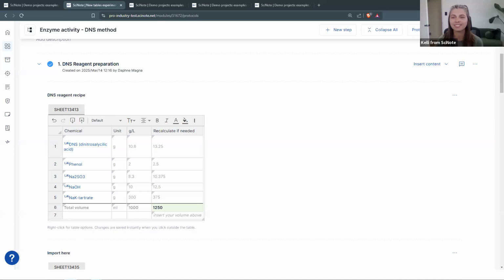both work. All right. Okay, so someone asked, I'm going to read the whole thing so we make sure you don't miss anything: I would like to ask if this update applies also to the already existing tables, which we already have in the protocols. Because in our team, we are facing some problems, mainly during the generation of reports. In our experiments, we are using bigger tables containing merged cells. And when we generate a report containing this table, it does not look good. Can you expect this should be already fixed? Thank you.